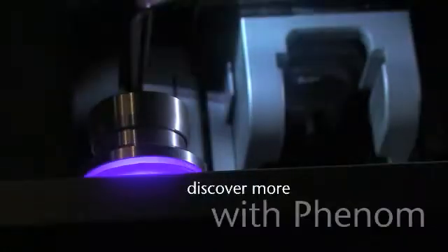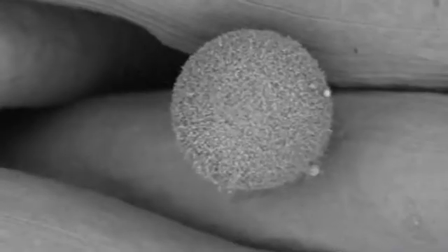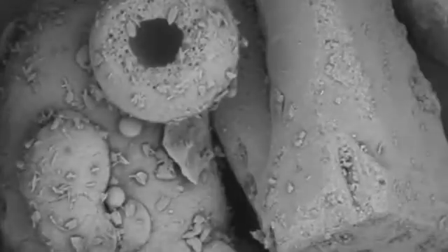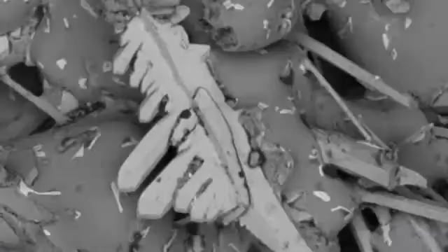Discover more with Phenom. From particles to powders, pharmaceuticals to materials. For science, industry and education.